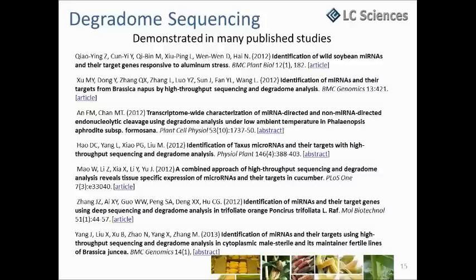So with next generation sequencing, we sequence the 5' end of the RNA degraded products. As I mentioned, after the cleavage, the RISC will leave a 5'-phosphate on the 3' end fragment of the messenger RNA. So using degradome sequencing, we will identify exactly what the sequence of the 5' end of that degraded messenger RNA is, and then obtain this information, the 5' end RNA sequences of about 35 nucleotides. We can map this back to the microRNA to see if they match any microRNAs, which is supposed to be near perfect complementary mapping to the messenger RNA at this part. I will show a little bit more in the following slides.